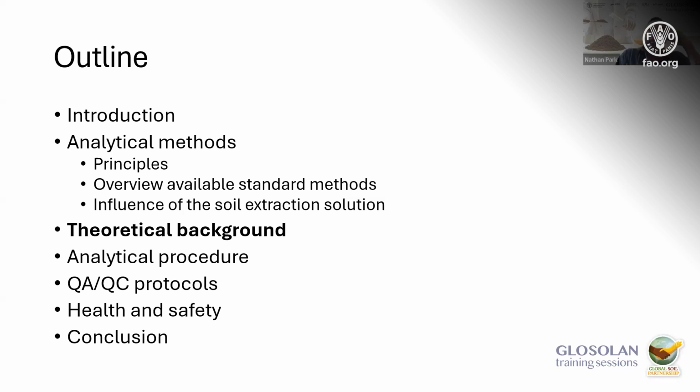Yeah, and I suppose these pH measurements are really ranges, so it doesn't really matter if your pH is 7.1 or 7.2. Yeah, if you take a new subsample, often you get already these differences. It's already included a little bit in the differences with the sampling and the measurement itself. Anybody else have any questions or comments before we proceed?